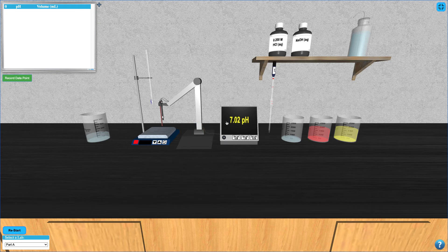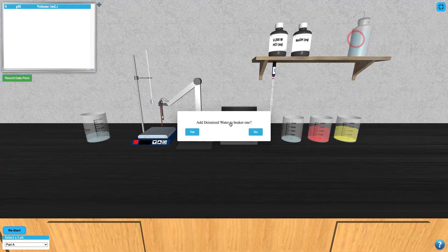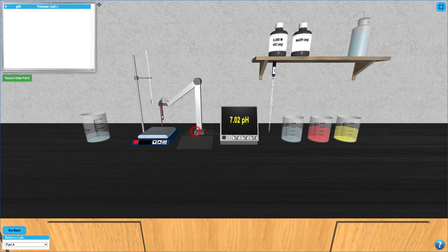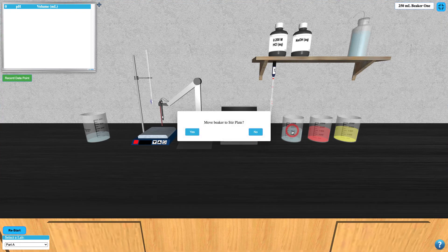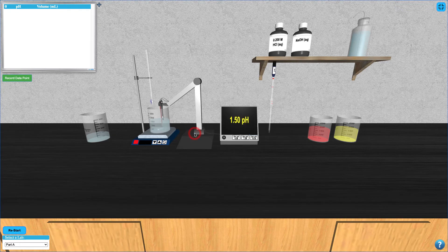Next, click the deionized water bottle to dilute the sample in the 250 mL sample beaker, then click it again to add it to the stir plate.